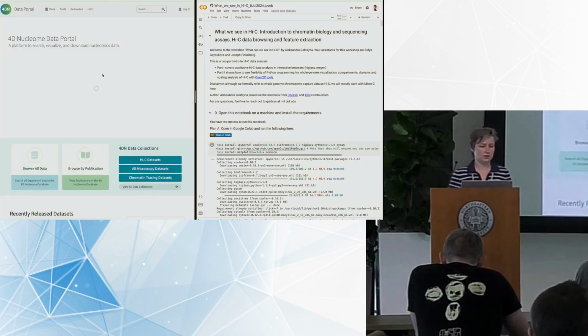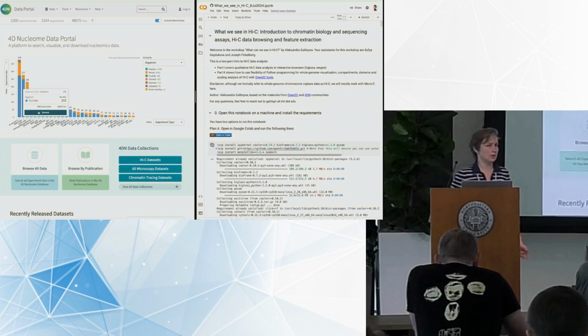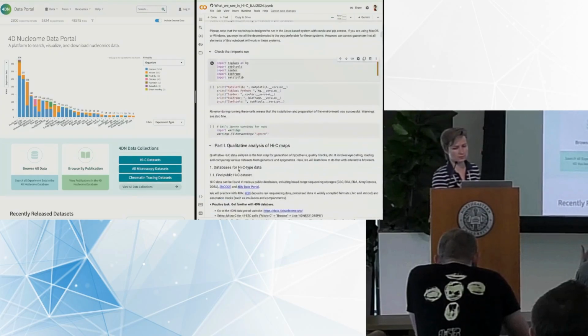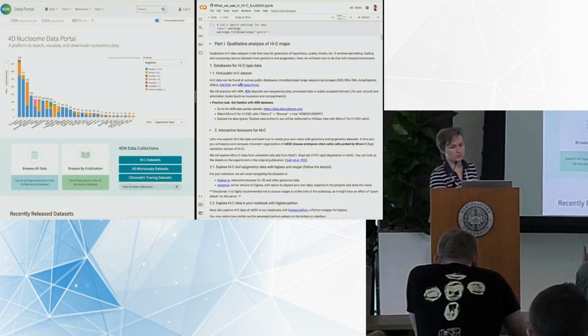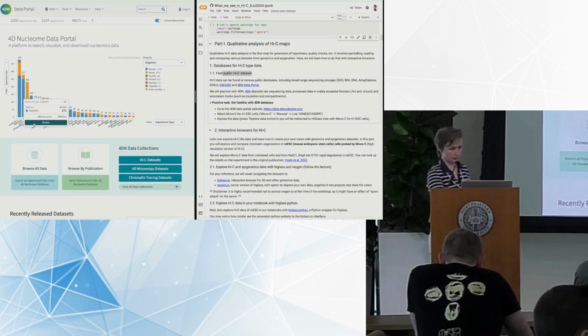So you can find a bunch of sources for Hi-C data, but let's try to explore this particular one. I will follow the 4DN data portal, and I will select some sample in situ Hi-C dataset for human. You can also do the same. You can follow the link for 4DN. It's present in your notebooks. If you scroll a little bit below, you will be able to see the links to the public Hi-C datasets. And there you will be able to click 4DN data portal and follow the same actions as I do. And here at the 4DN portal, I go to some sample Hi-C human data.